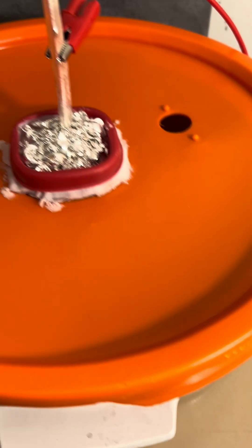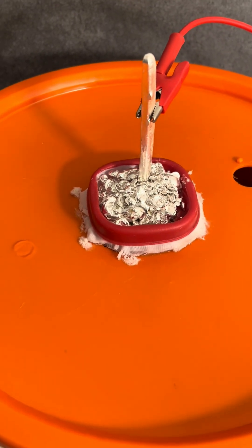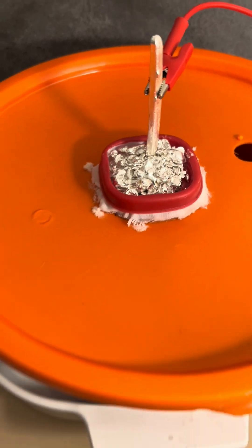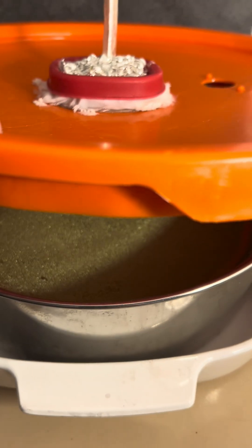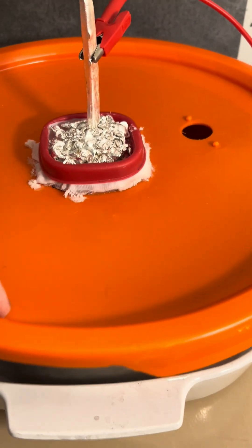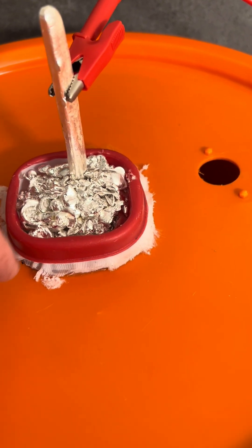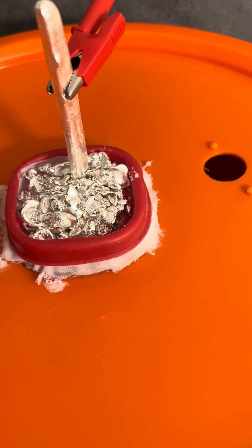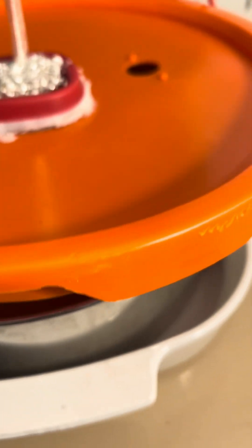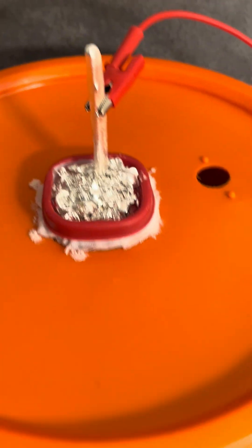This is my anode basket. This is where I will capture precious metals and other things and slimes, which will stay in the basket. The nitric acid will dissolve the silver here and it will go through the membrane, the cloth. The silver ions go towards the cathode and that's where they stick to the surface.